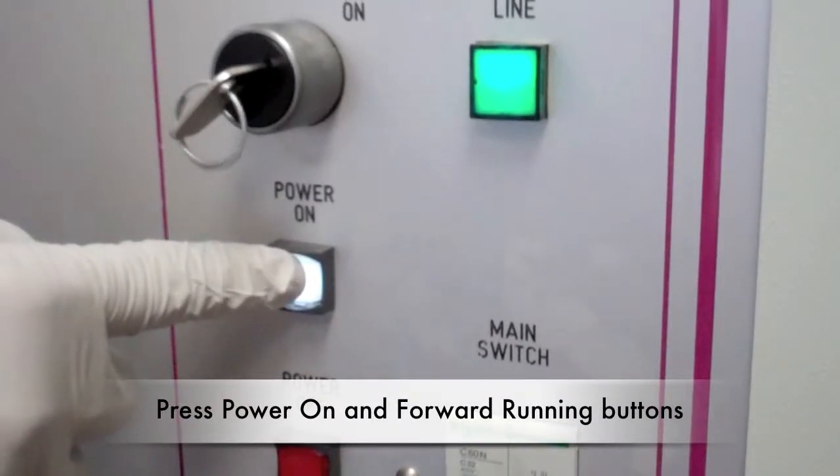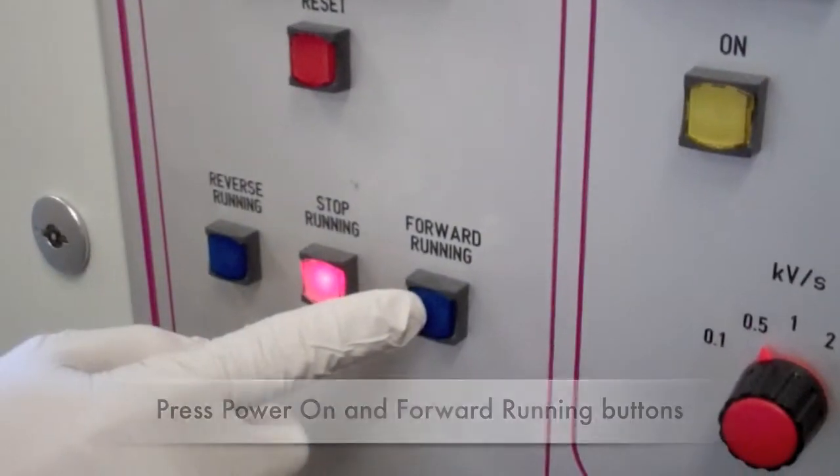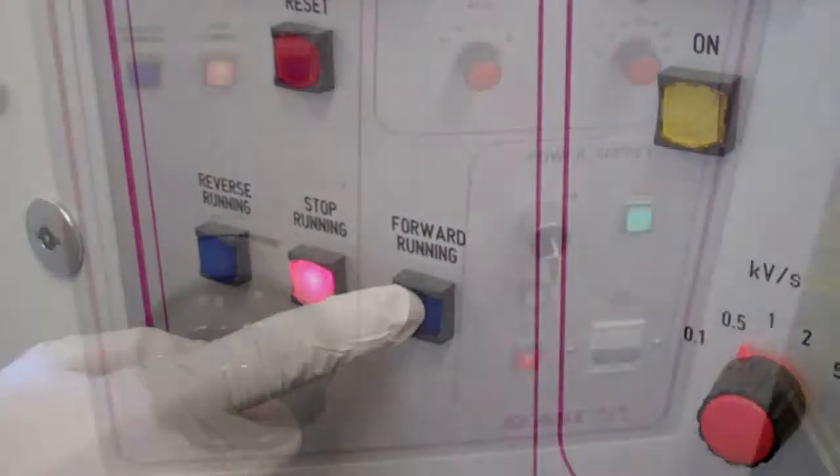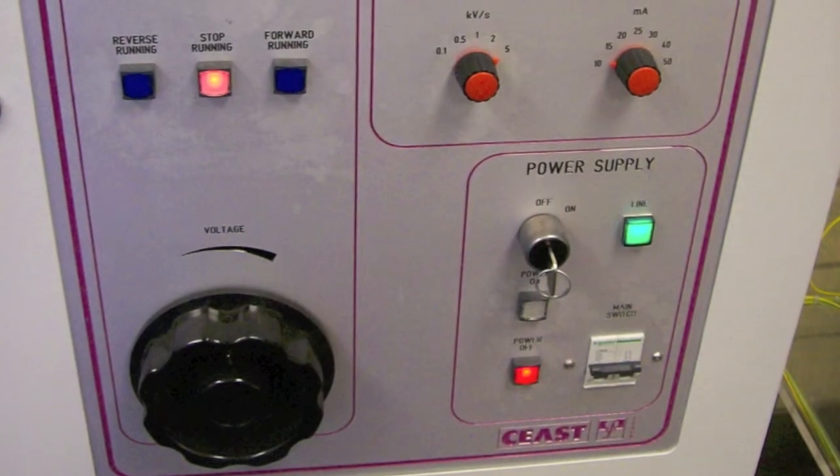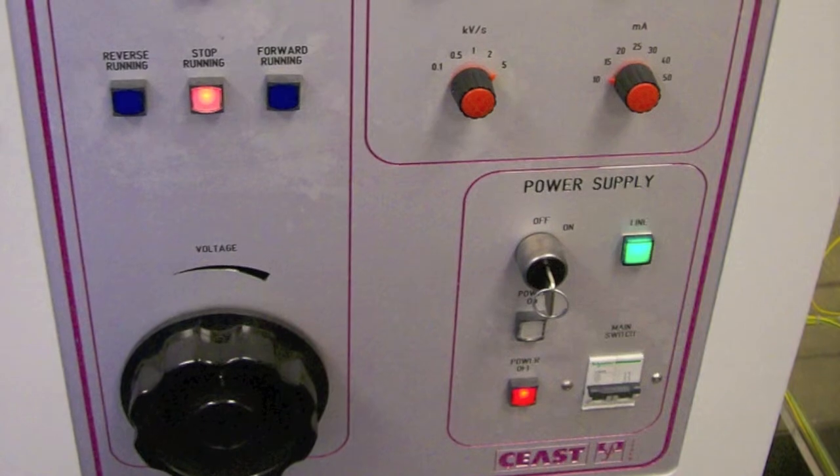Press the clear power on button to allow voltage to build. To begin the voltage increase, press the forward running button and the voltage knob will begin to turn clockwise. The voltage will now be increasing at a rate of 0.5 kilovolts per second.